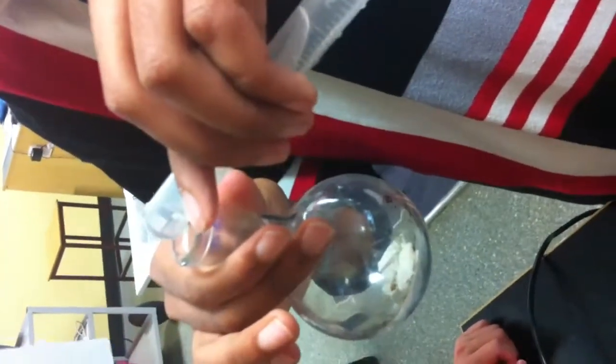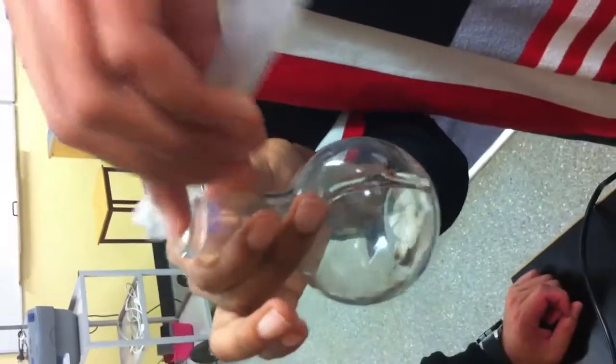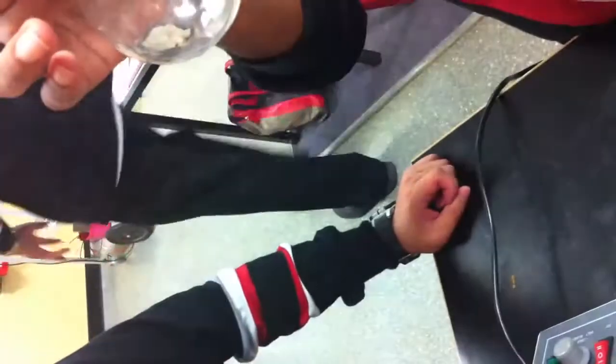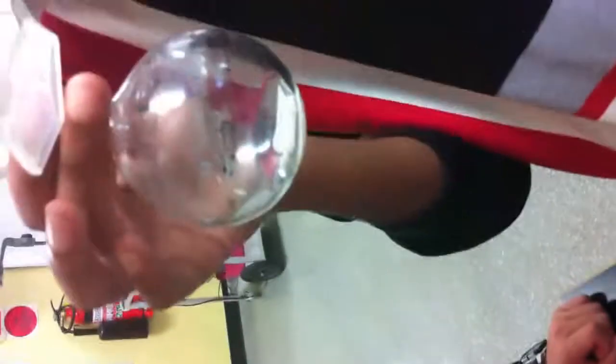So what are we adding? That's boiling chips. That's ethanoic acid. That's octanol. How many mils of octanol? It's 4 mils, but I poured a bit more. Okay, so 4 mils of octanol. Awesome.